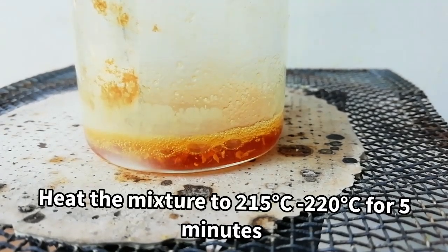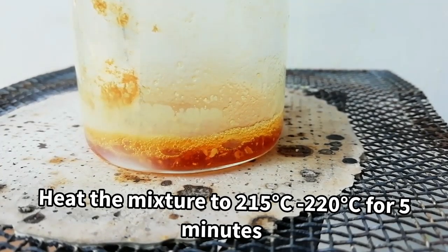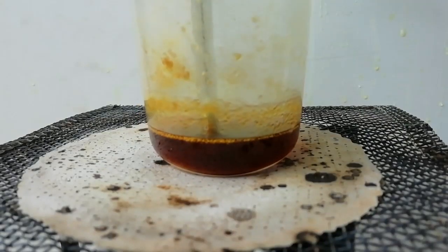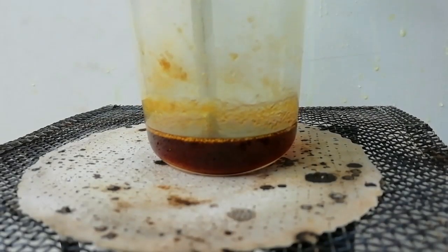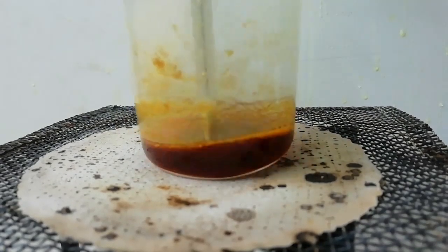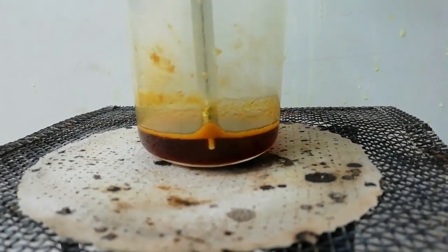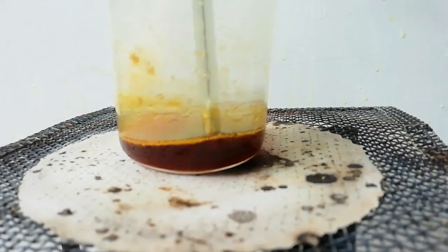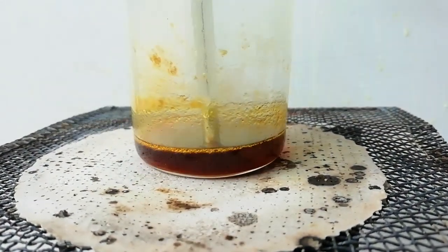The mixture is heated between 215 to 220 celsius for 5 minutes. When it reached 100 celsius water will evaporate off. Then the temperature reached 215. Solution turns to dark red color. It is okay.